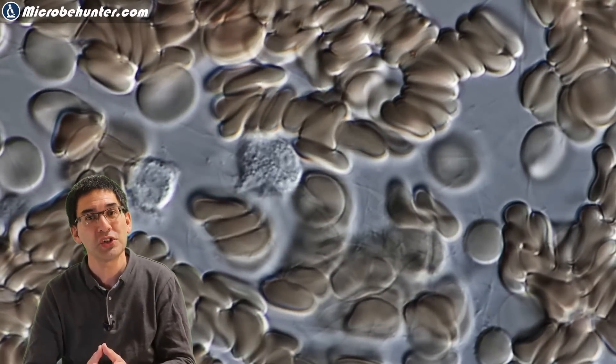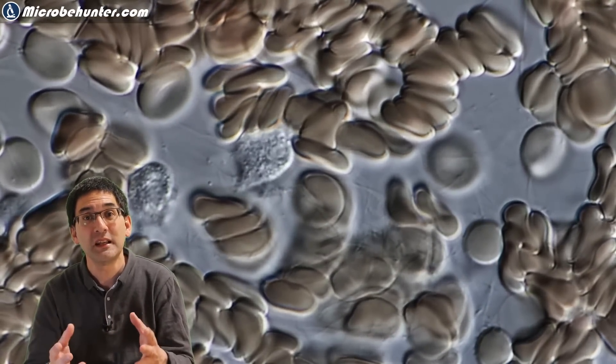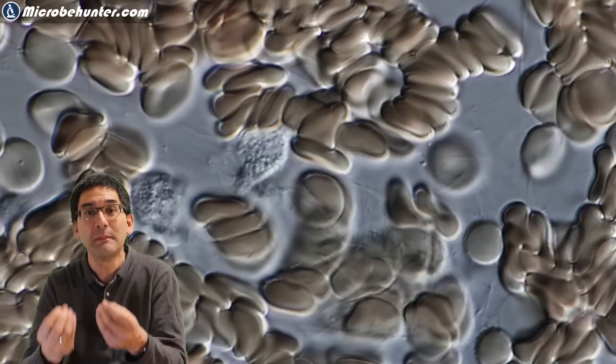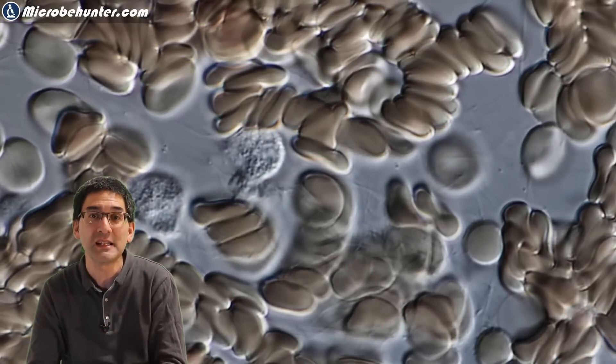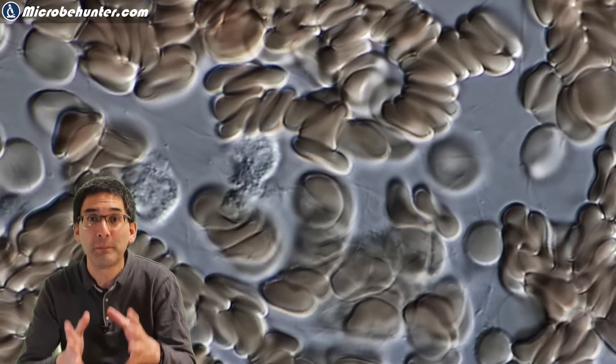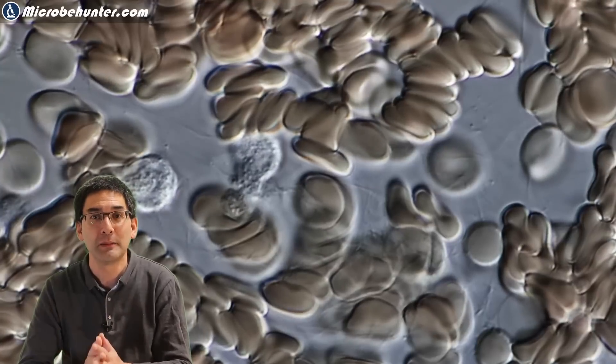You might wonder how do they find them. Well, there are several ways how this actually works. One way is that they are able to follow the chemicals that the bacteria release, and they are therefore able to follow the path of the bacteria and find them.